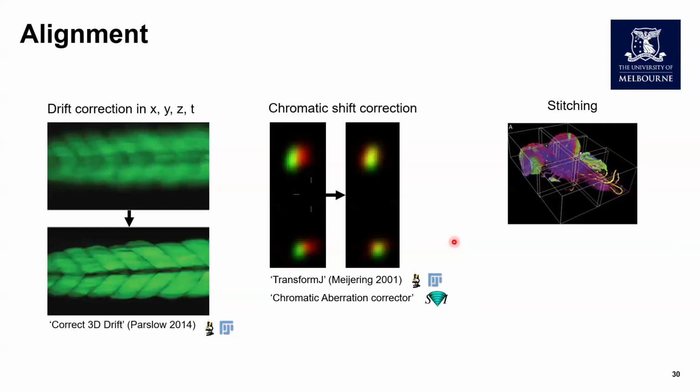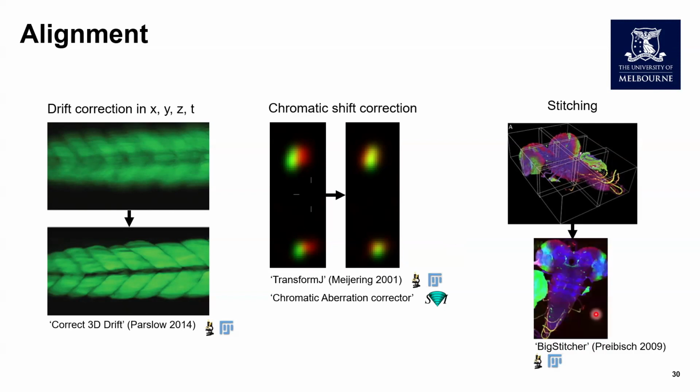Another case that image needs to be aligned is when the microscope images were taken in multiple positions to create a big mosaic. Regardless of whether your image is 2D or 3D, it should be stitched to make a seamless large image before any further analysis. BigStitcher is a great Fiji plugin tool for stitching large tiles.